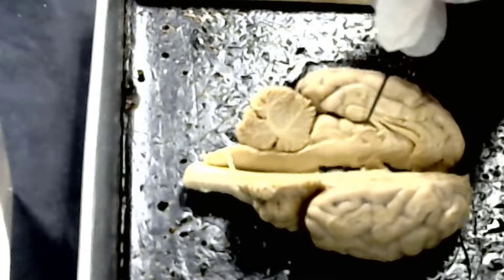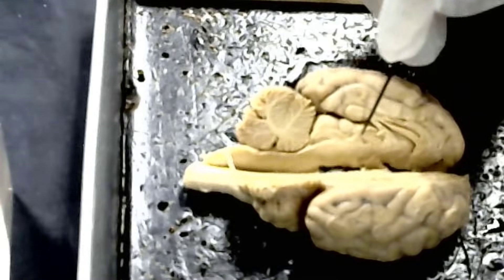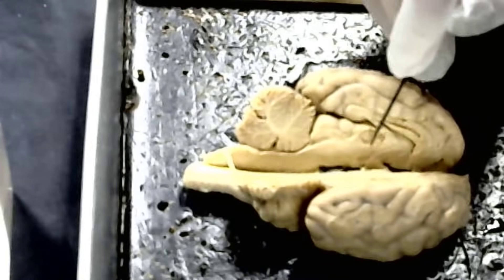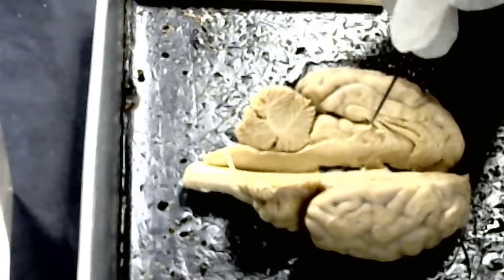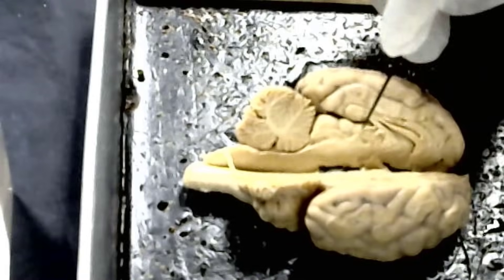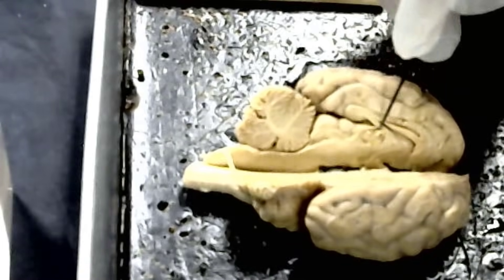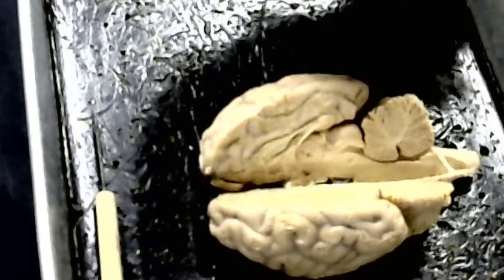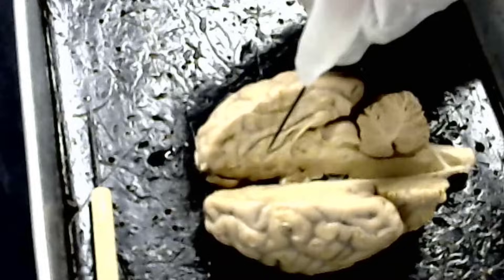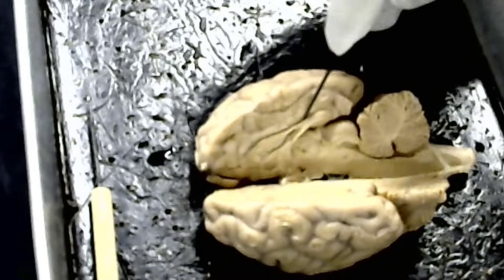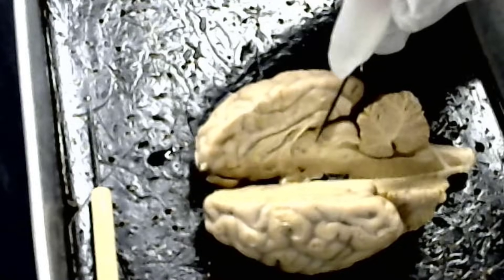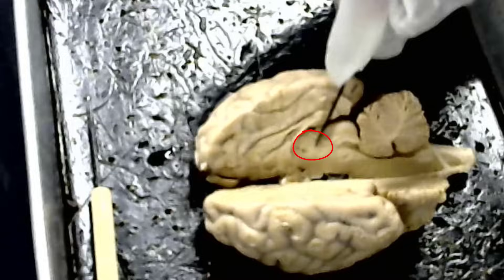If you look just behind the fornix, you'll see a circular region which is just slightly more pigmented than the surroundings — this is the thalamus. I'm going to flip this around to the other side because this side has it a bit more clearly defined. On this side, the corpus callosum and fornix are nicely visible, and the thalamus is really nicely defined right here.